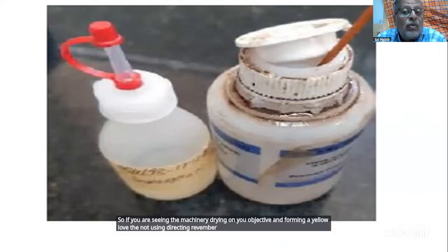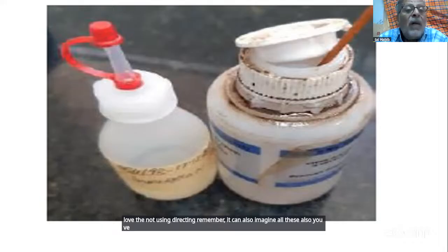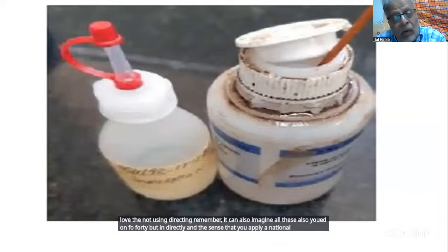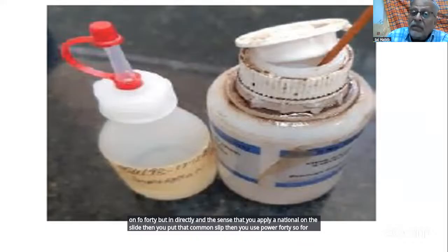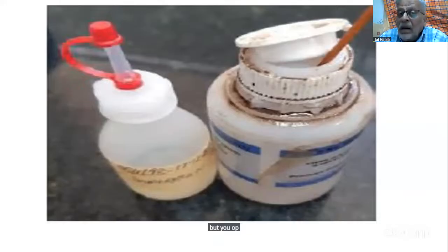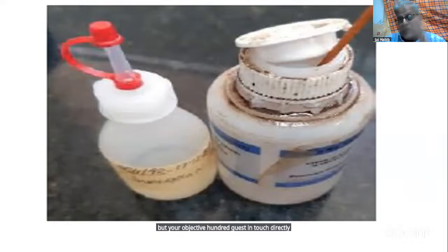Remember, immersion oil is also used on power 40 but indirectly, in the sense that you apply immersion oil on the slide, then you put a cover slip, then you use power 40. So power 40 is saved, but your objective 100 gets in touch directly with immersion oil.